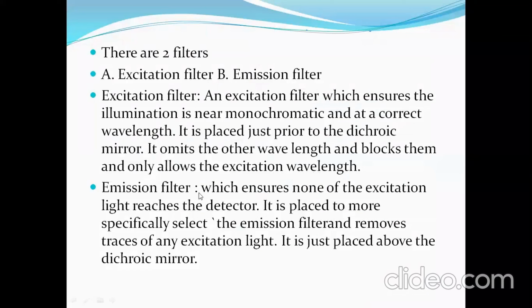The emission filter ensures none of the excitation light reaches the detector. It is placed to more specifically select the emission wavelength and removes traces of any excitation light. It is placed just above the dichroic mirror.